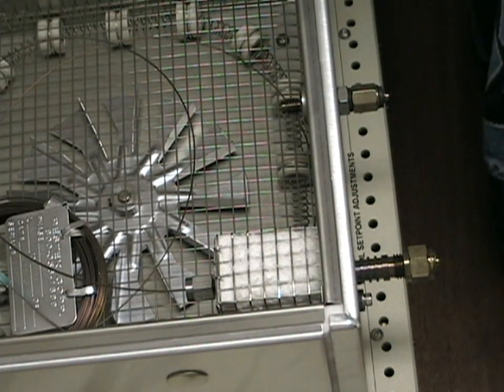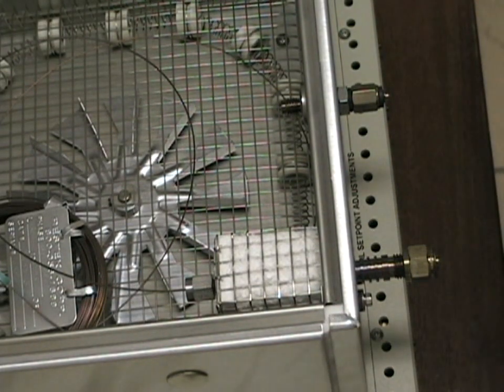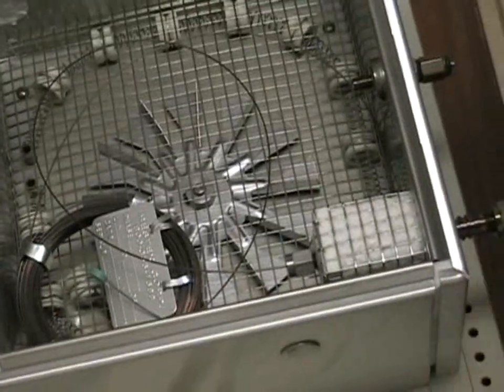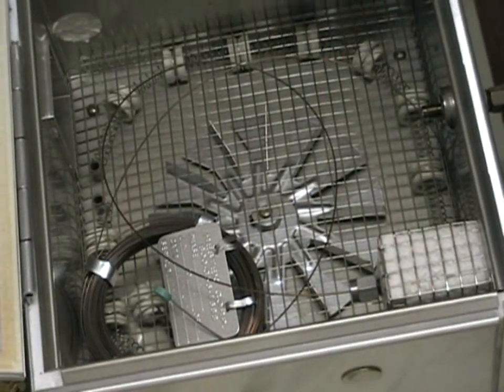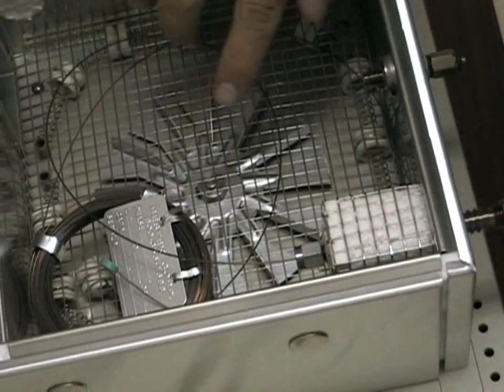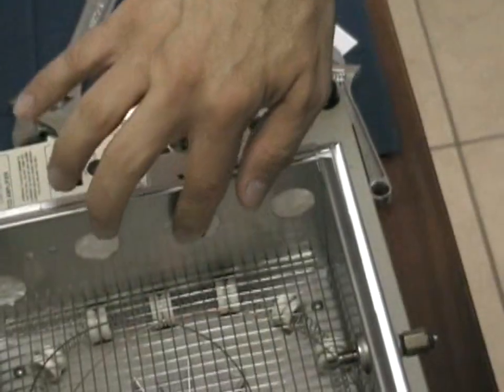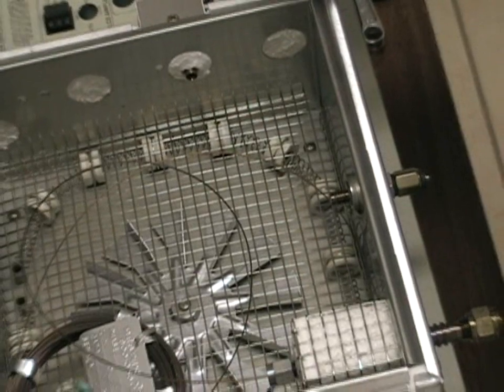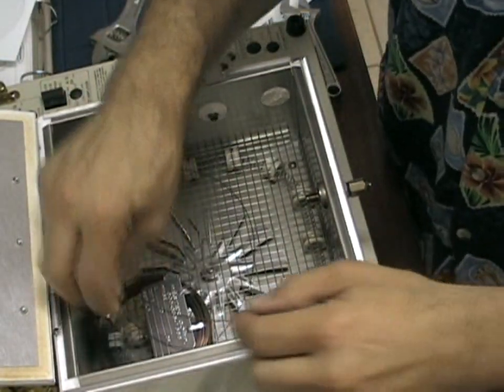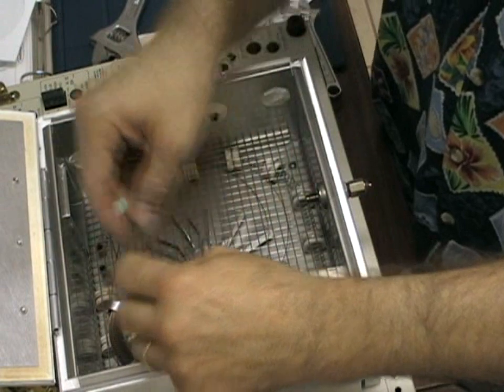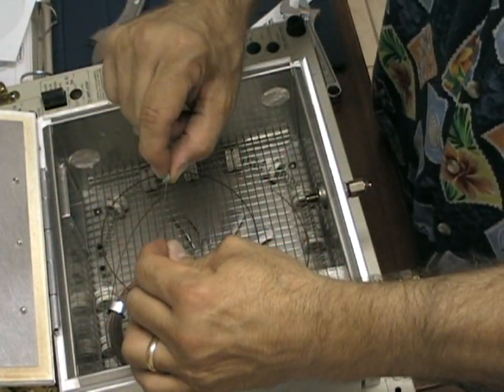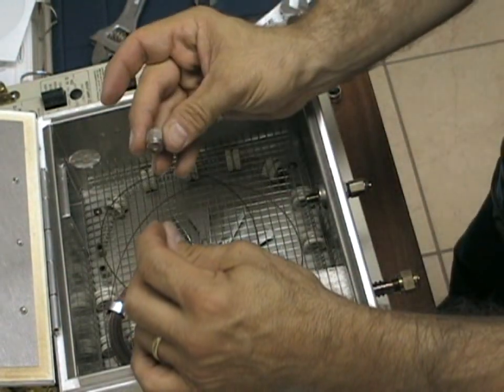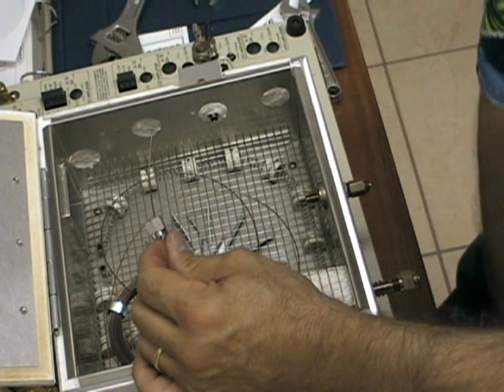Next, we need to connect the outlet end of the GC column to the GC detector. In this case, we're using an FID detector on the opposite side of the GC. Remove the safety cap from the end of the column.